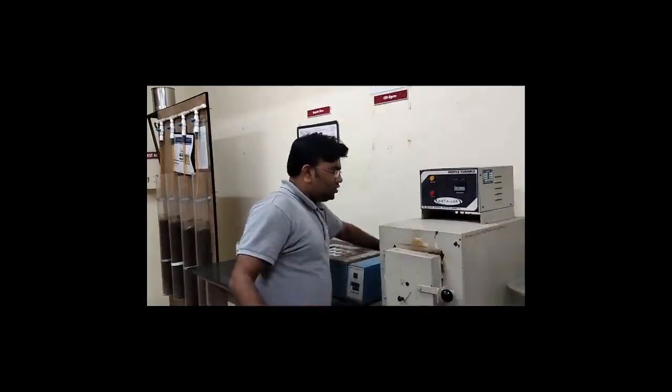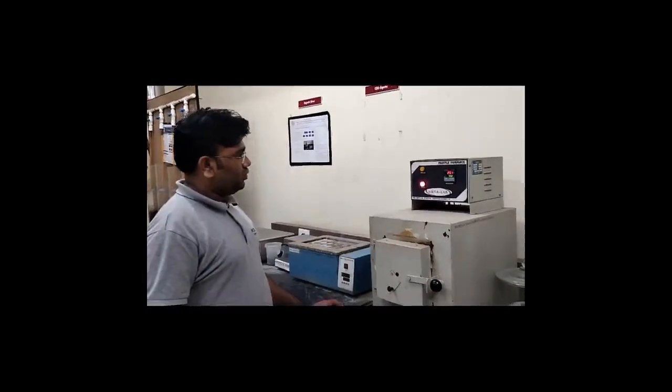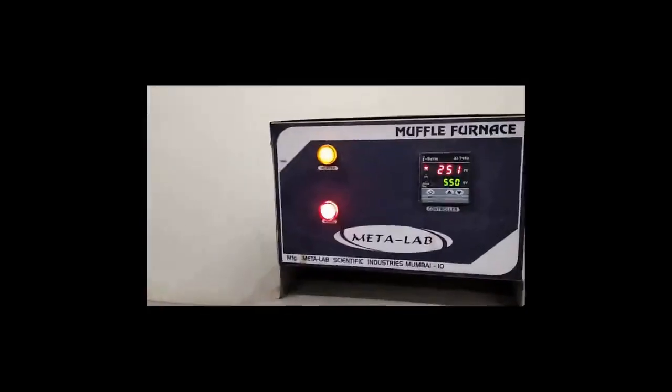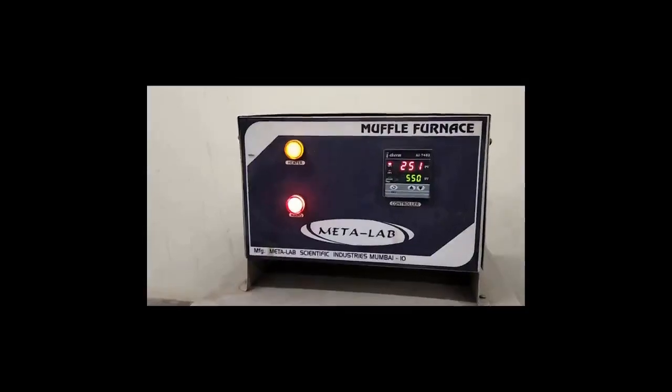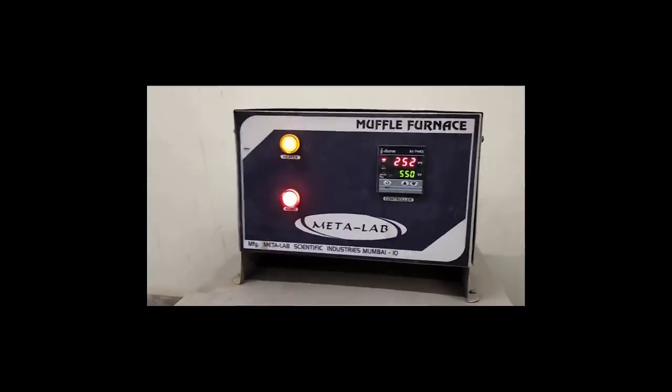So let me start the muffle furnace. Now it is 250 degrees Celsius inside temperature. It will rise to 550 degrees Celsius in about 15 to 20 minutes, and then at 550 degrees Celsius we have to keep these crucibles for half an hour.